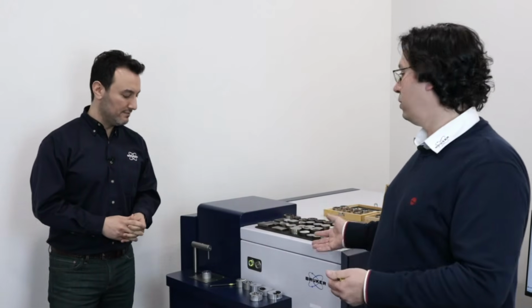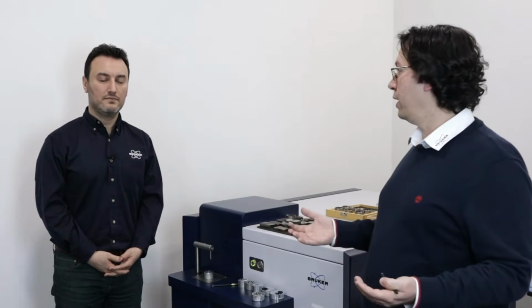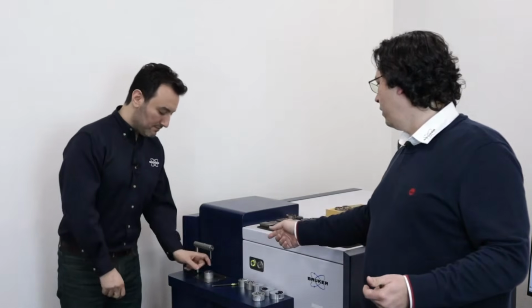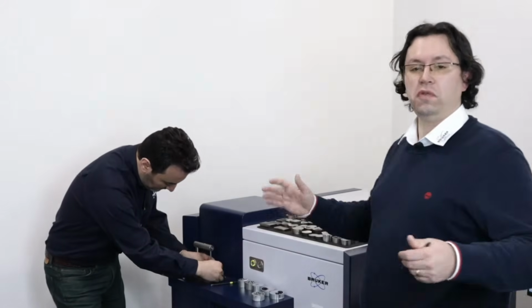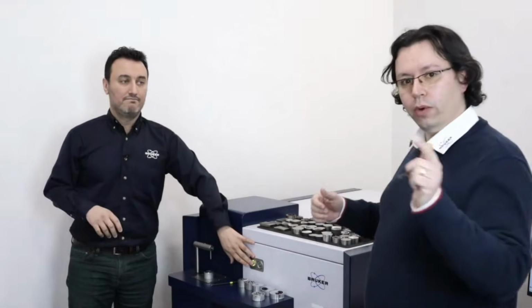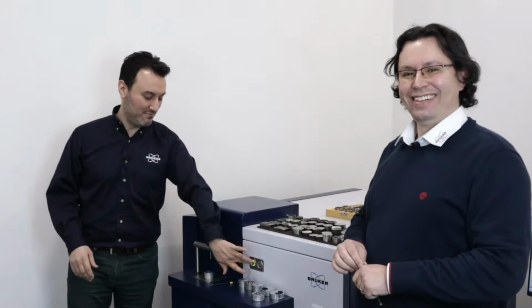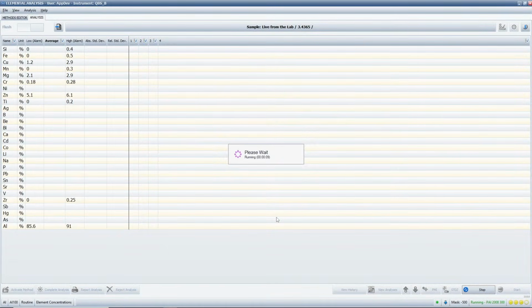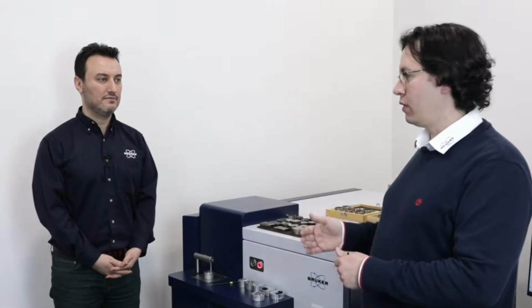Now on the Q8, since we checked already a cast iron sample, we're gonna change the alloy. We're gonna check now an aluminum alloy. Yeah. And if it's within the grade that is specified. This one that we have now is one with, let's say, I think it's 0.15% silicon. Or maybe not, that's why we're gonna find out right now. And that's why it's important to have the same analysis procedure for OES. We just press the button once the sample is ready. To start, just place the sample in the spark stand, press start, and there you go, you start your measurement.